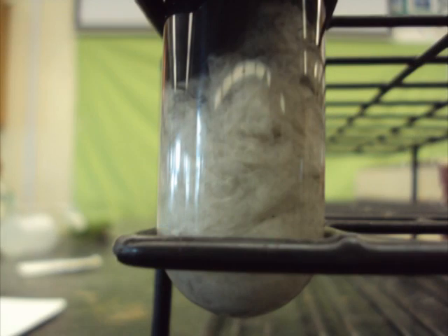In the bottom of the column, there is anaerobic sediment. This is because the cellulose depletes the oxygen in the residue and in the water. Anaerobic bacteria will then grow and produce hydrogen sulfide. In this case, Desulfovibrio and Clostridium are predominantly the bacteria. Clostridium breaks down the cellulose into glucose, which it ferments to produce a range of simple organic compounds such as ethanol, acetic acid, succinic acid, acetone, butanol, etc.